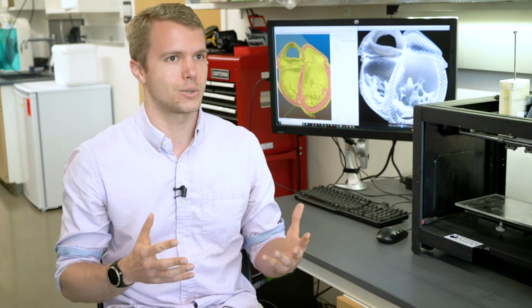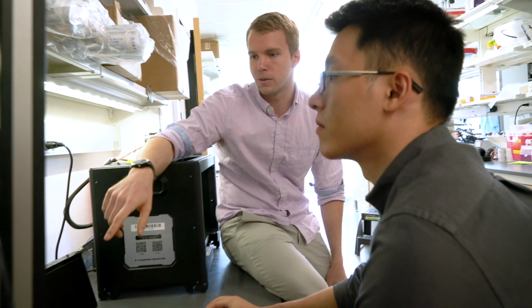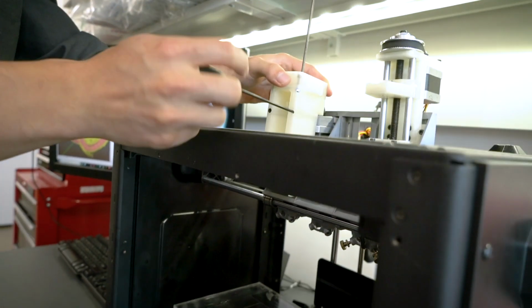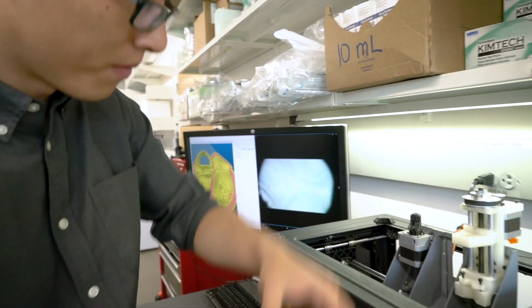So developing a technique that prevents it from deforming, but also finding a way to initiate a pH change to neutralize it in order to cause it to gel, as opposed to a thermoplastic which needs to be melted and cooled, which are easier to 3D print. So with those things combined, we've developed this entire tissue engineering platform for regenerative medicine for anything like wound repair or any type of bioengineering, and it can all be implemented on a 3D printer that you can essentially buy for anything like a high school for very low cost.